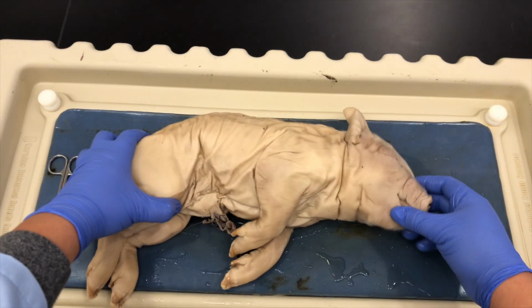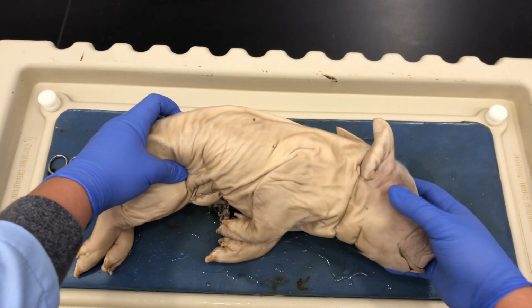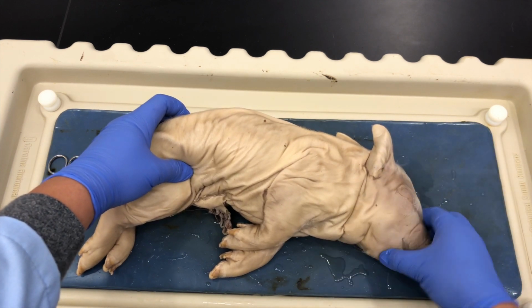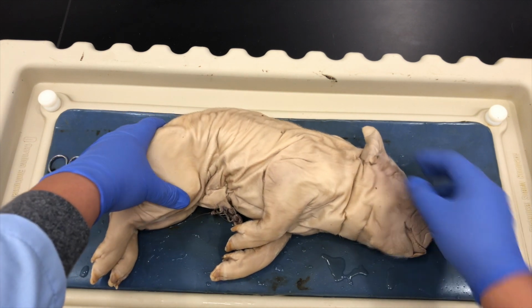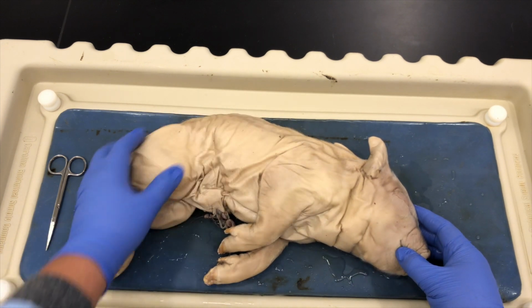Hi, in this video I will identify the external anatomy as well as dissecting and identifying the internal organs of a fetal pig. Here we have a fetal pig, and the first thing we will be looking at is the head of the fetal pig, right here. We can also see part of its neck right there.